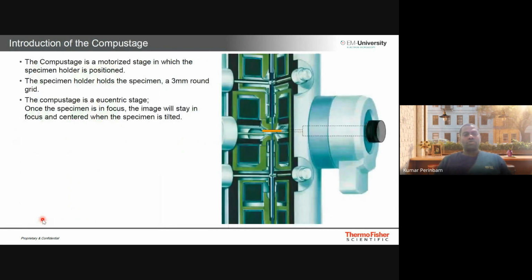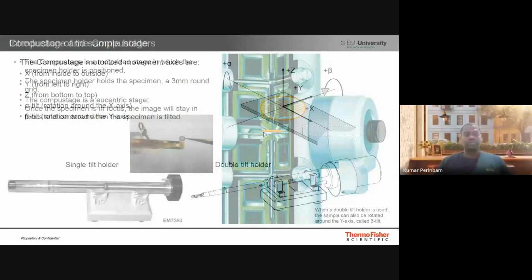So nowadays, almost all of it, maybe only 10% of this is done manually, and the rest is all computerized. All these condensers are adjusted by extremely powerful computers, and even the sample, which is loaded over this socket, or the hole over here, is also practically operated by the computers.